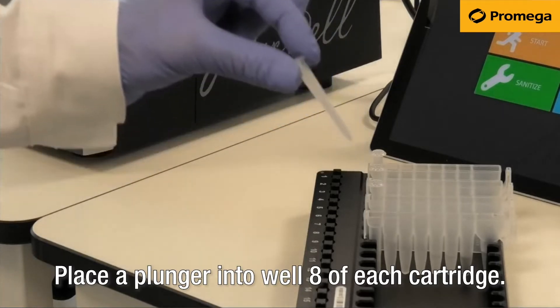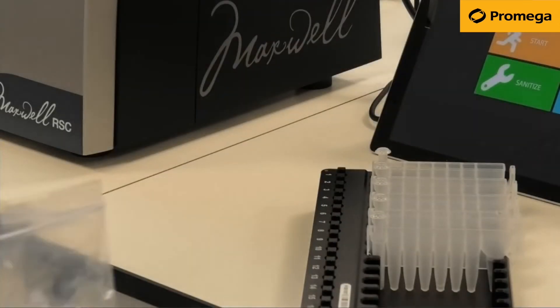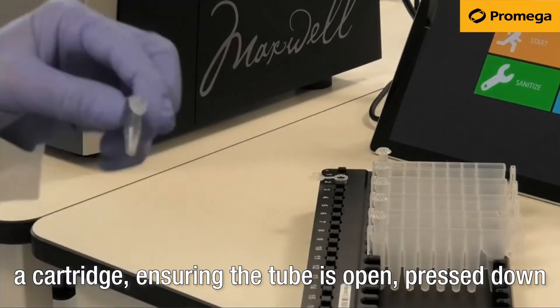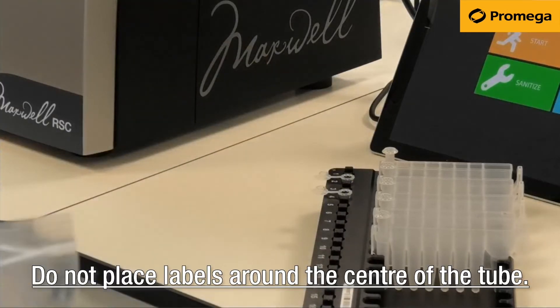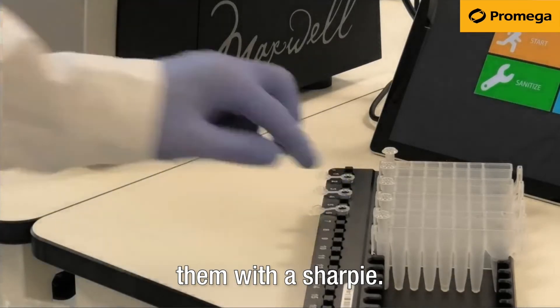Place a plunger into well 8 of each cartridge. Place an elution tube into every row where there is a cartridge, ensuring the tube is open and the cap is facing to the bottom of the tray. Press down firmly. Do not place labels around the centre of the tube; if marking is required, please write on them with a sharpie.